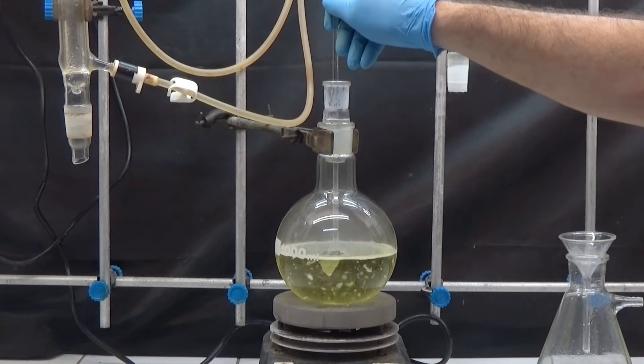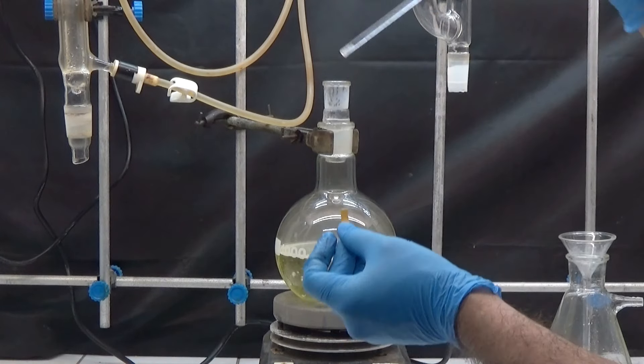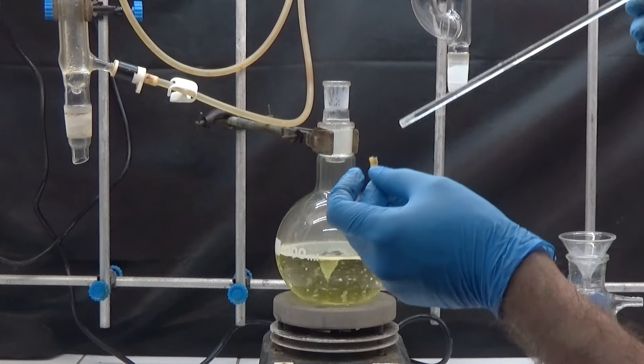After adding 50 milliliters of ammonia, we check the pH. We continue adding ammonia until the pH to be alkaline.